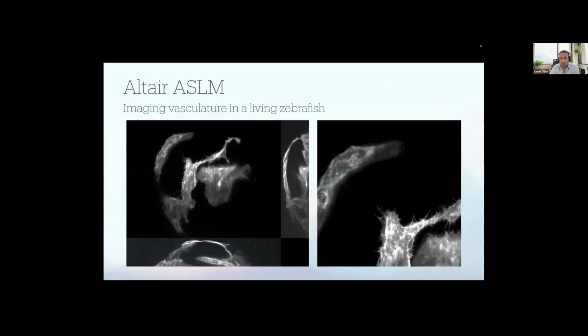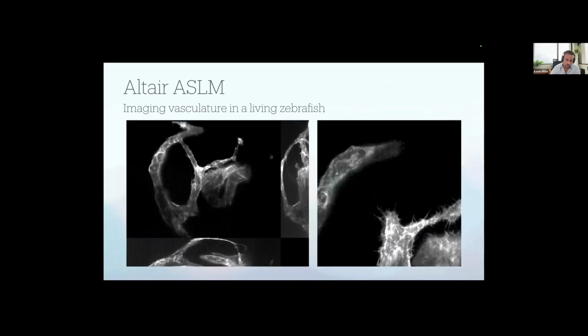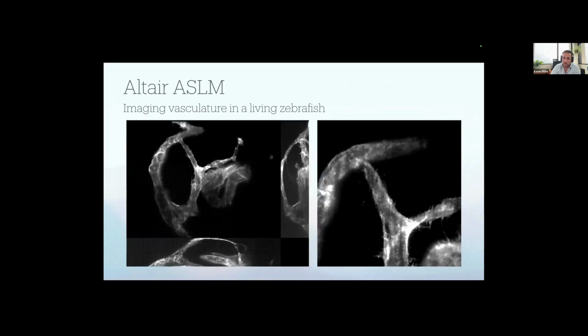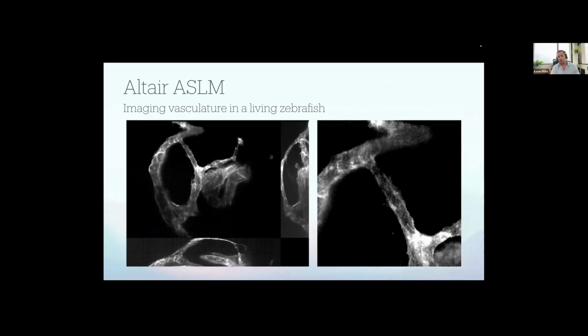So we've just now really started to benchmark this on biological experiments. We imaged a zebrafish here, and we could see the formation of the vasculature and see this really nice, beautiful migratory behavior that's initiated by cells creating these spiky filopodia. And this is inside of the fish. So the imaging is actually not incredibly easy, but overall, quite pleased with those results.